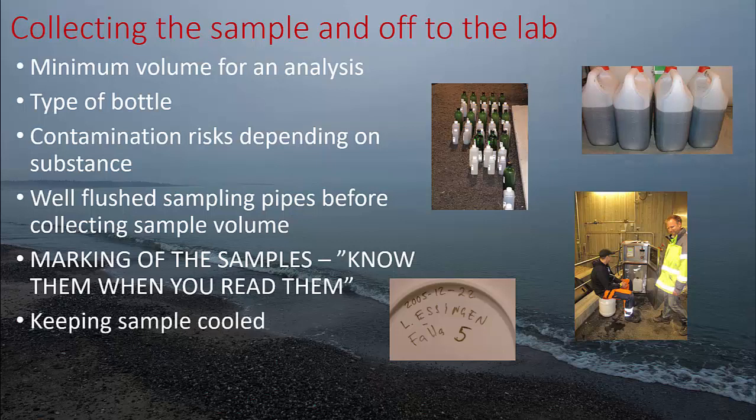Now, next, keeping the sample cooled. Not so much to say about that, quite standard. Also, transport to the lab. When you've taken the sample, try to get it to the lab as soon as possible. And always check with the lab, are there some analyses you take there that you can't store more than maybe 10, 12, 24, 48 hours. Always check this.